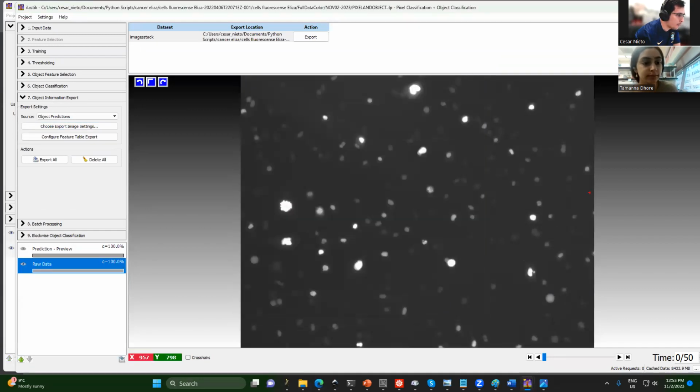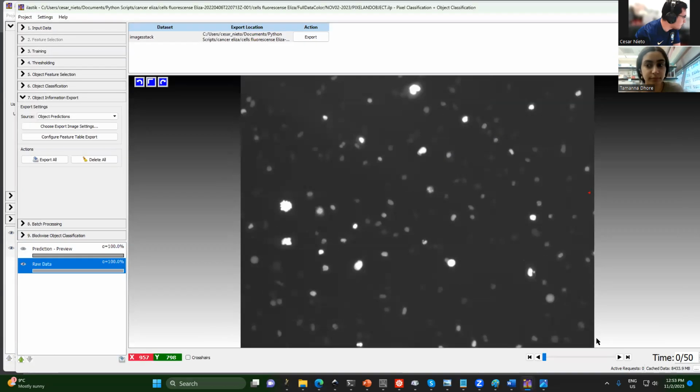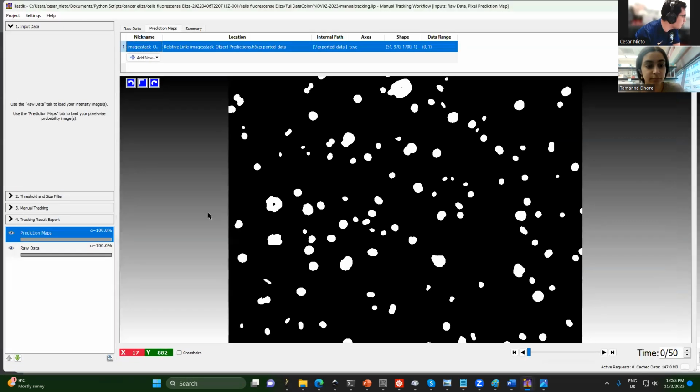Okay, makes sense. So it seems that we did it. Where is tracking? Here.